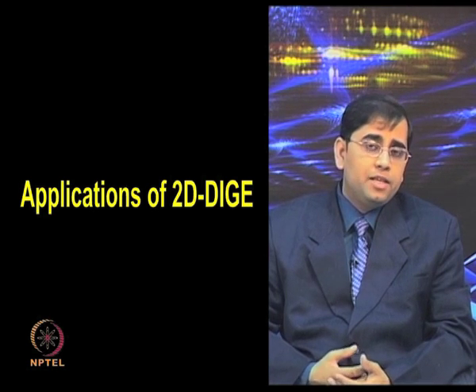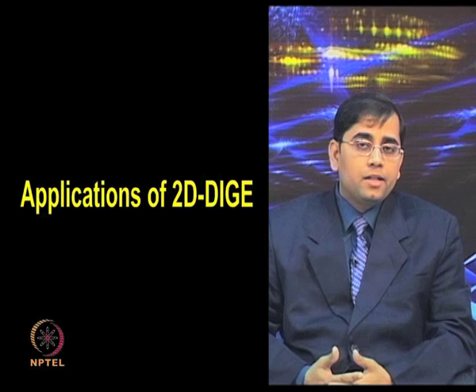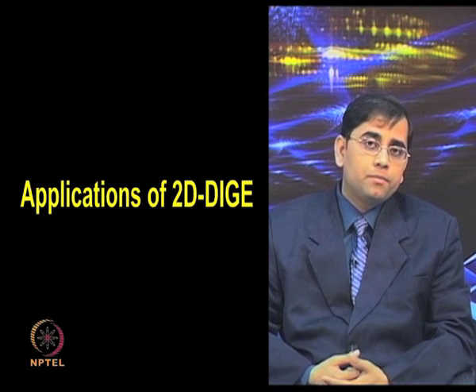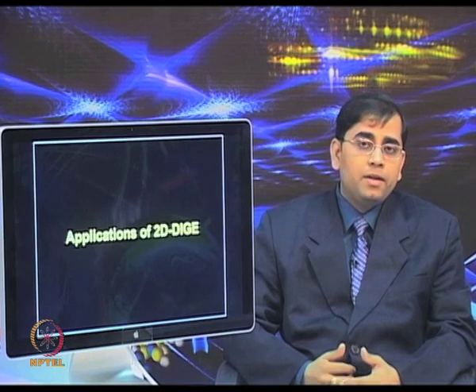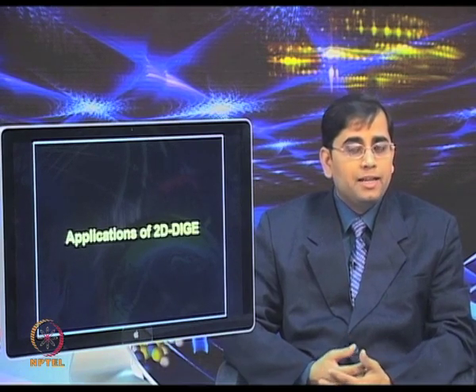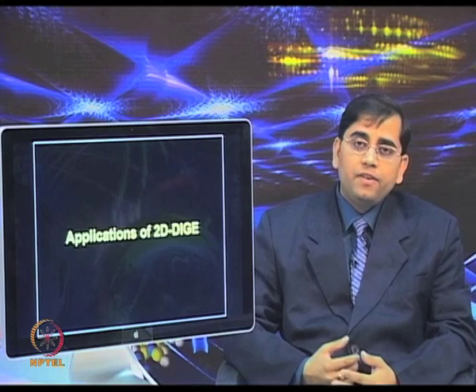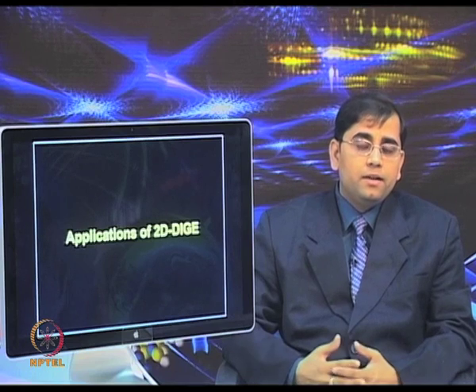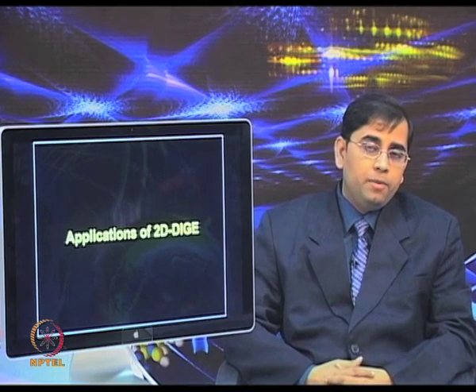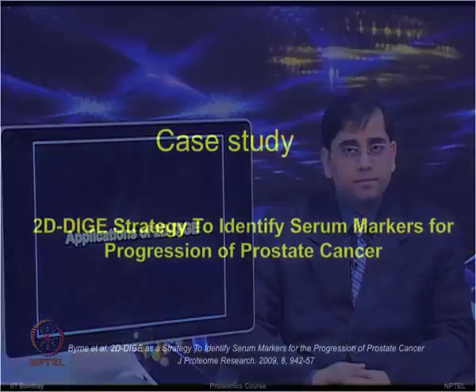If you see the recent publications, you will appreciate there are several papers on each of the biological systems for different types of applications, whether it is cell signaling, developmental biology, plant proteomic analysis, neurosciences, clinical studies, or different types of diseases including cancer. You will find there are hundreds of publications available which have employed the power of the 2D-DIGE technique.